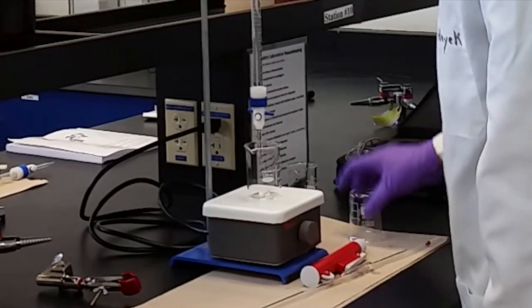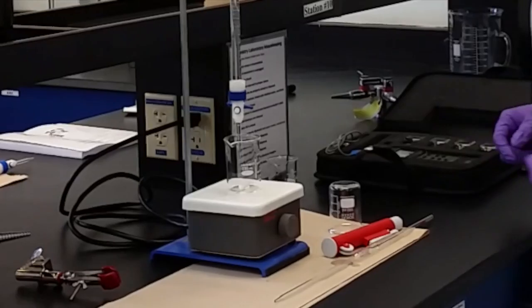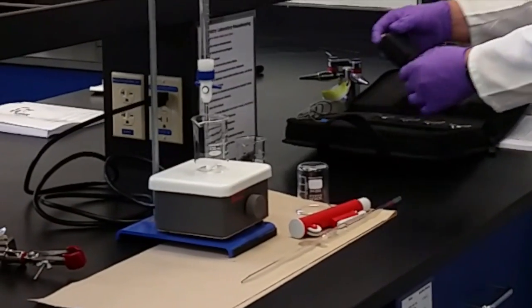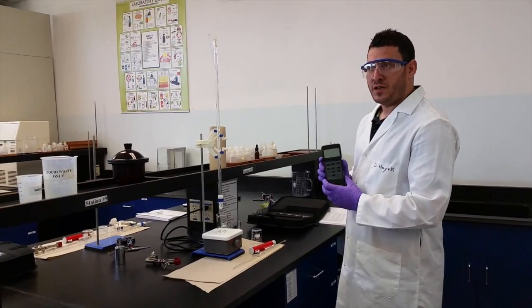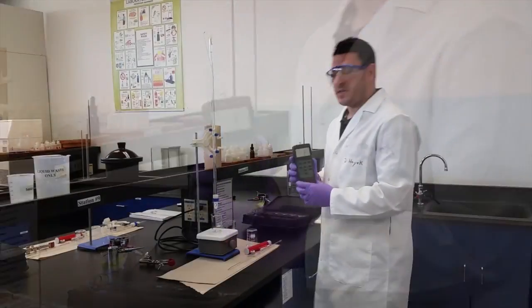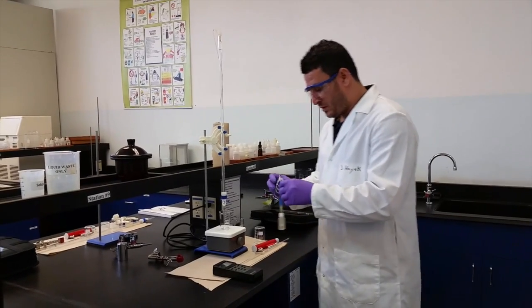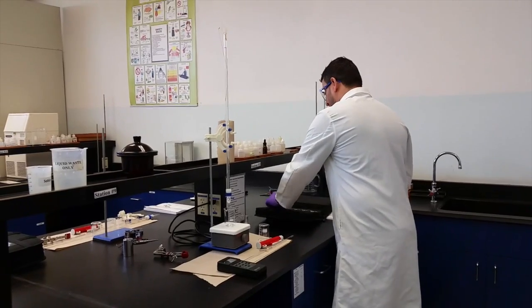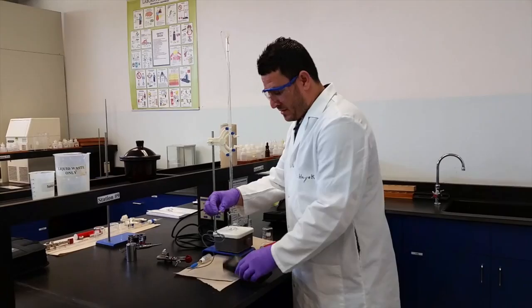Okay? Now before adding the acid here, you have to set up your pH meter. Now this is the pH meter. To turn it on, all you need to do is hit power. It's already calibrated. Now this pH meter wouldn't work without the probe. So that's why you take the probe. It's fairly easy to connect it, okay?